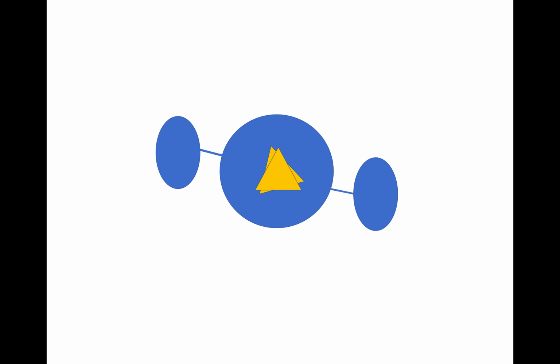And I think the best way to tackle this would be to apply a mask to the center and then later go on and 3D classify these regions to find the variability within them. What you would do in this case is apply a mask to only focus on the center and not the whole particle.